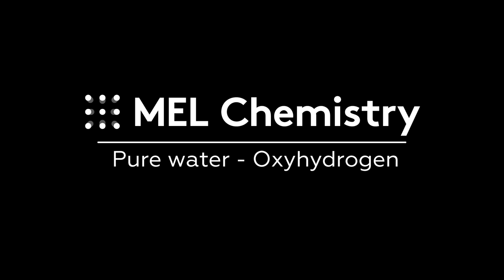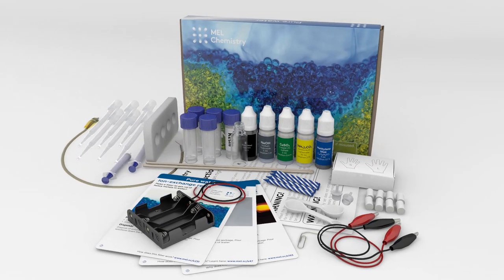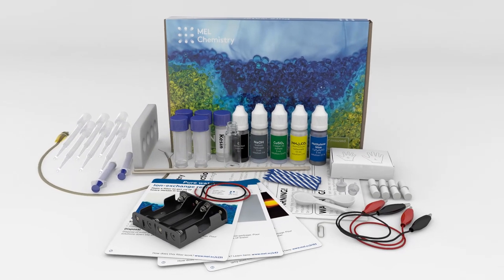Welcome to the wonderful world of chemistry. Today, with the help of the pure water set by Melchemistry, we will obtain an oxyhydrogen mixture from water electrolysis.